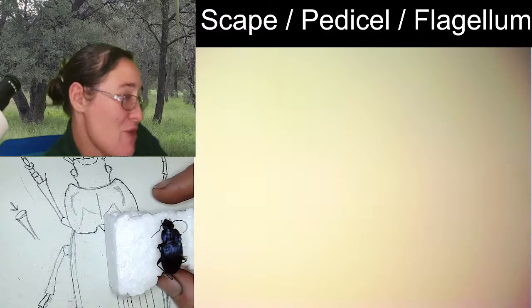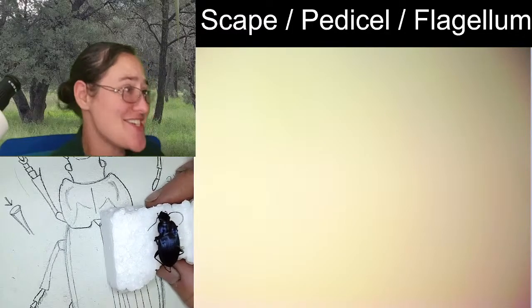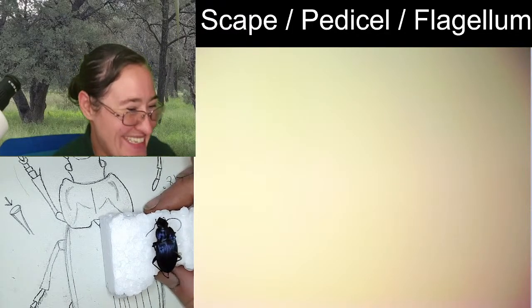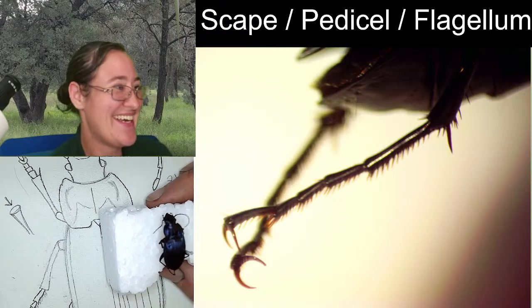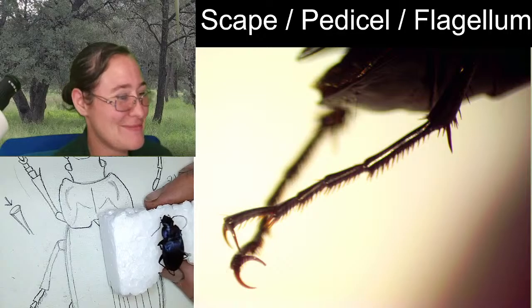Long legs. They run really fast. These are cursorial legs. They're not just ambulatory. Bug words. I love them so much.